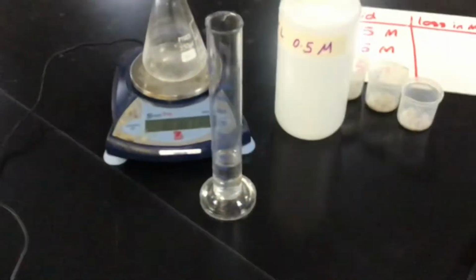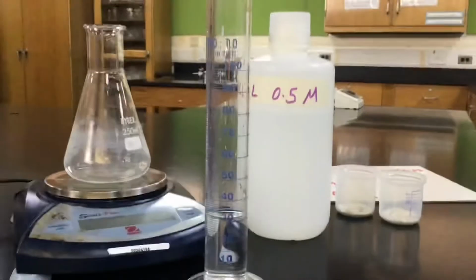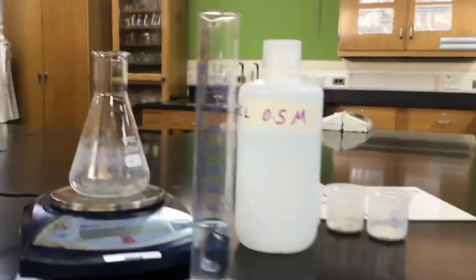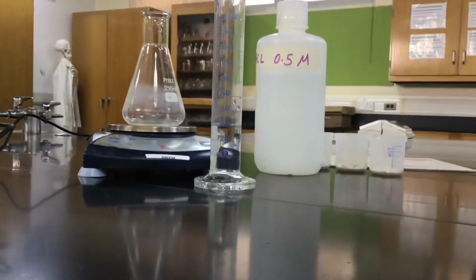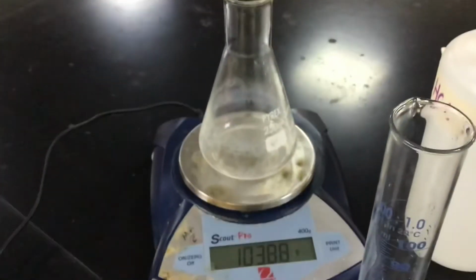Okay, I'm not sure if I managed to edit this or not, but I had a quick location change. What we have in this measuring cylinder here is 30 millilitres of 0.5 molar hydrochloric acid, and we have a conical flask here.